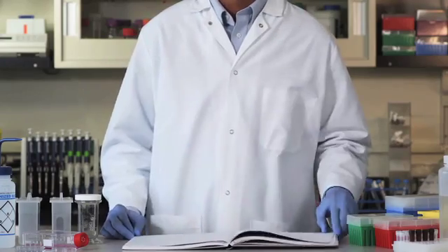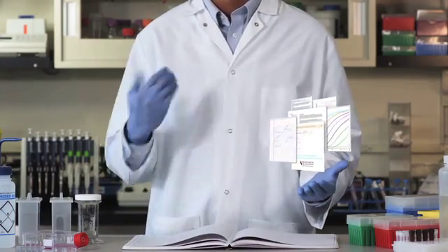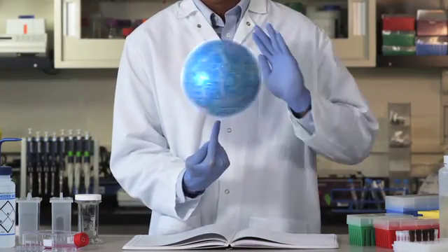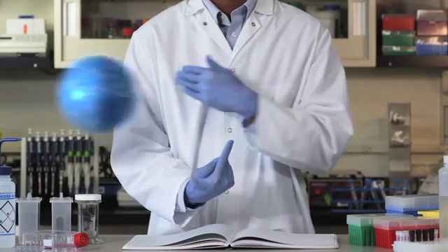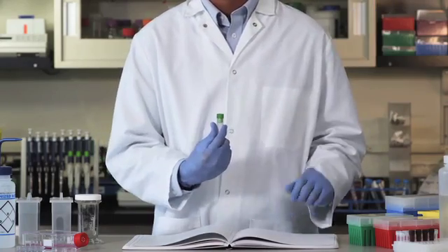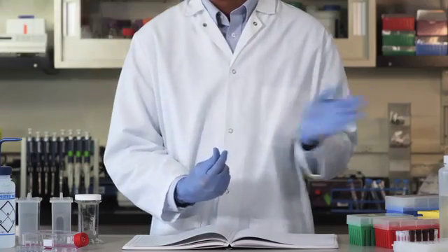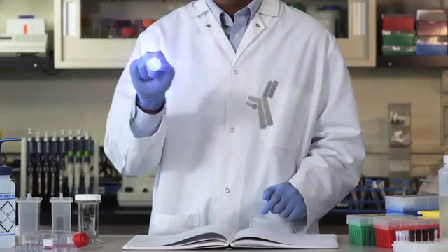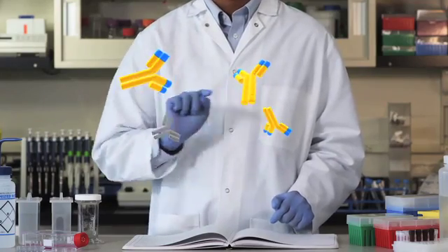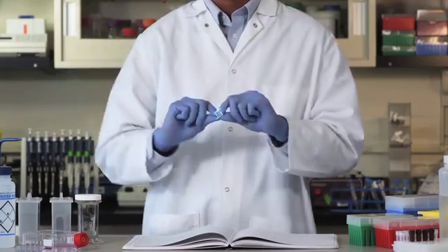I'm a cell biologist, and this is my research. I'd like to know which cells are expressing my messenger RNA and how many copies are in each cell. I've shown upregulation using qPCR, which unfortunately destroyed all of that sample. Staining with antibodies confirmed a heterogeneous cell population, but the results are only semi-quantitative.